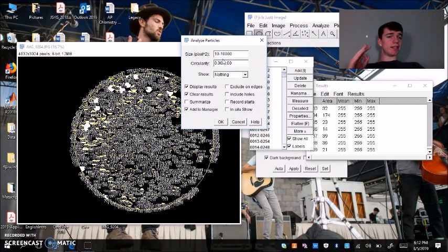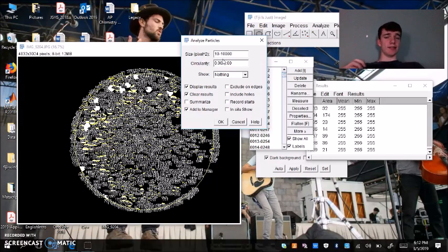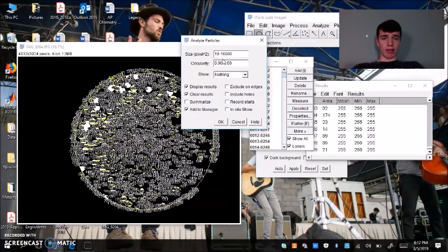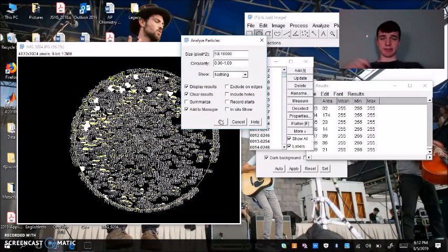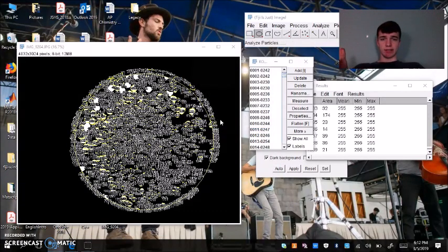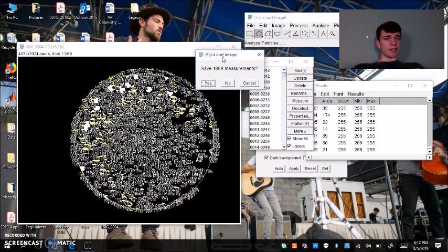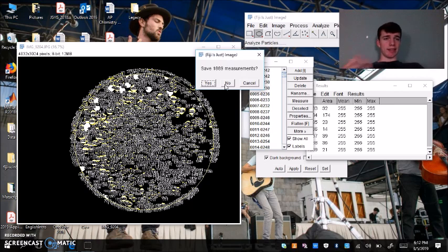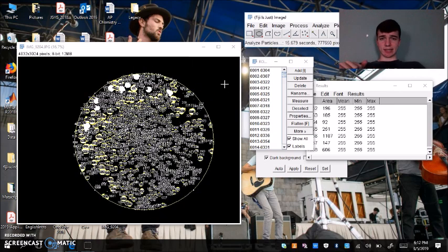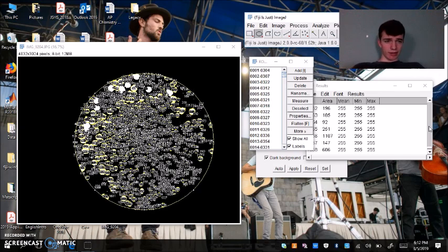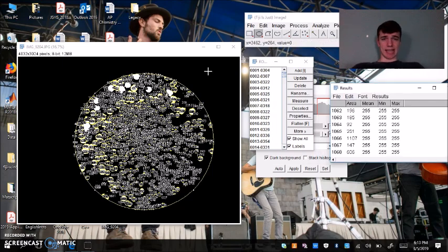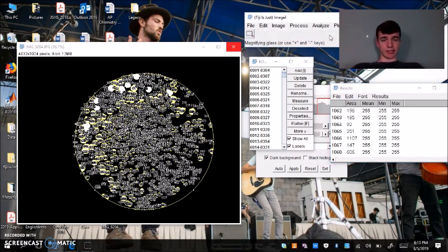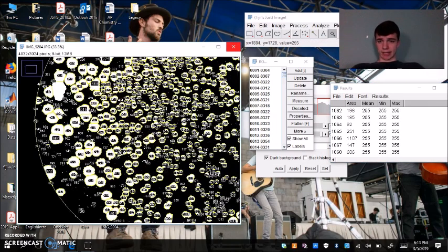Since before I said that we counted colonies that were a little too small, I could increase this to a minimum of 50 pixels. Just run it again. This might pop up. You can just hit no. That just means that it'll discard your past analysis and open up a new one, which says that we have around 1,068 columns.